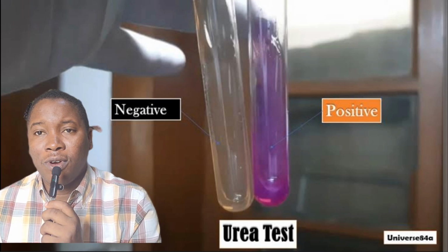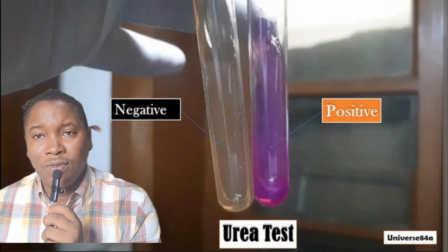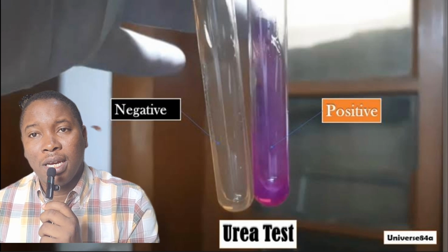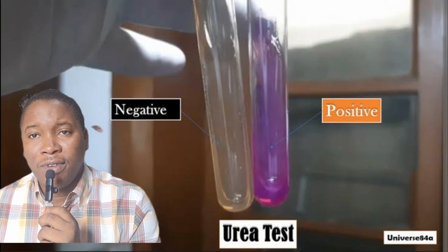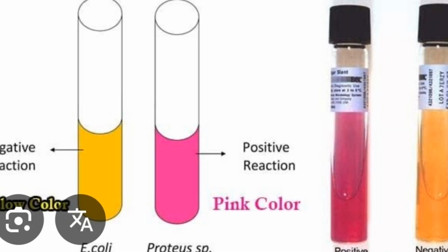Like I said before, you want an indicator to show that the pH of the medium has changed from slightly acidic to slightly basic. In Christensen's urea agar, which is very commonly used, you have phenol red. Phenol red is the indicator that changes color to show us that a pH change has occurred.